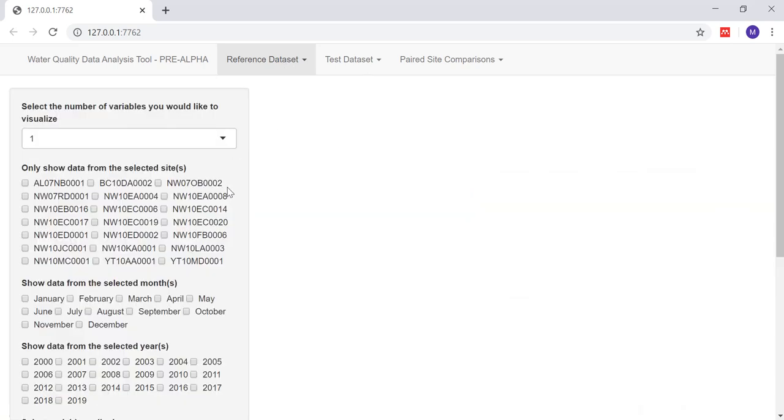The menus on the graphic visualization page can be a little busy at first, but we'll go through each part individually. First, you get to select between univariate, single variable, or bivariate, two variables. For example, if you wanted to look at only the distribution of, say, alkalinity, you would use univariate. If you wanted to visualize your alkalinity data across time, you would use bivariate, with your date column as the x or second variable. Let's start with a univariate example.